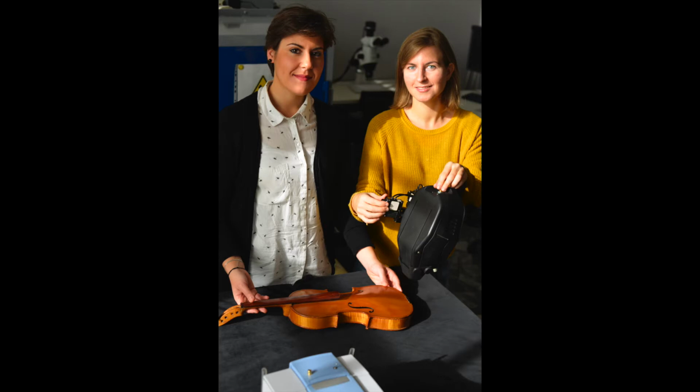of the surfaces. And we use here two spectroscopic techniques. One is the FTIR technique in reflection mode, Alpha, and the other one is the XRF technique by the ELIO instrument. The ELIO instrument is very important for us, even if we work on artworks like violins that are mainly made of organic material. It's very important because we need to understand which kind of inorganic particles or pigments were used during the construction procedures of the ancient violin makers.